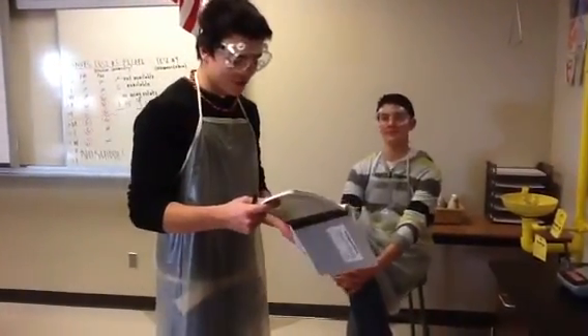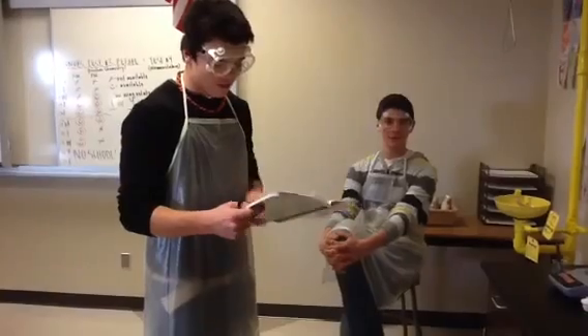My name is Dakota Anderson. My name is Jason Anderson. Today we will be discovering the percent composition of oxygen in potassium chlorate.